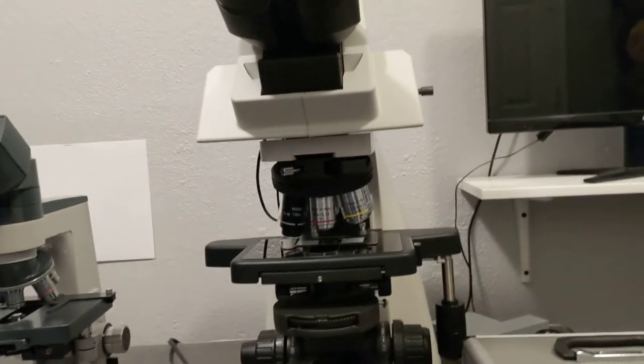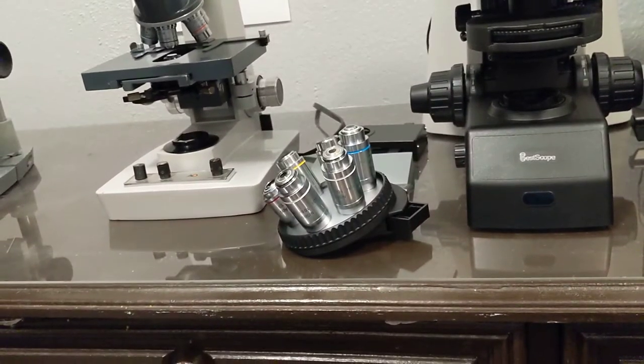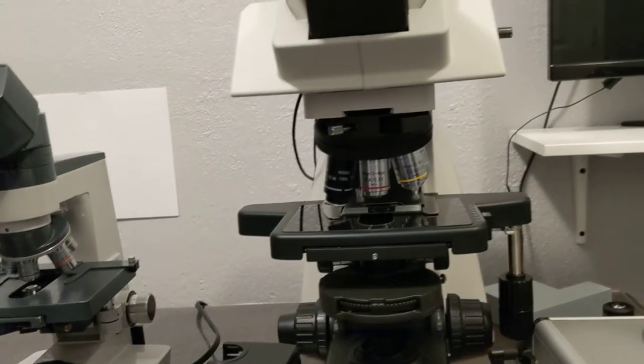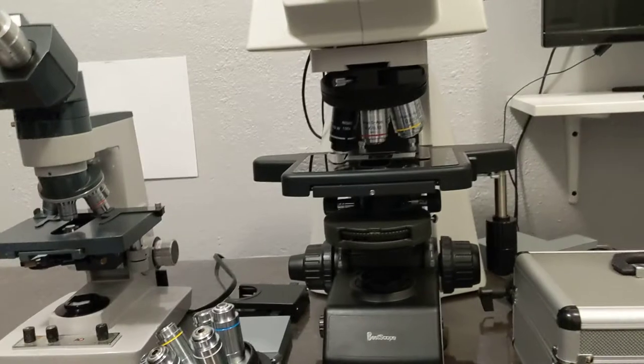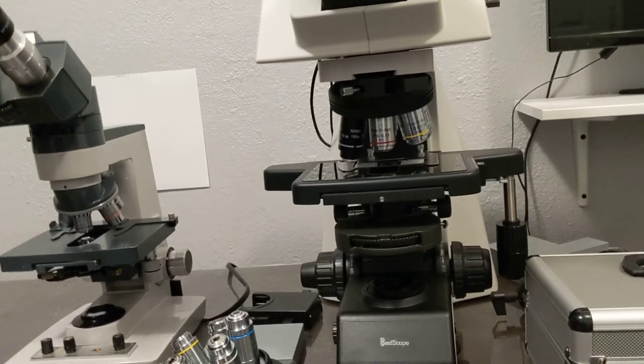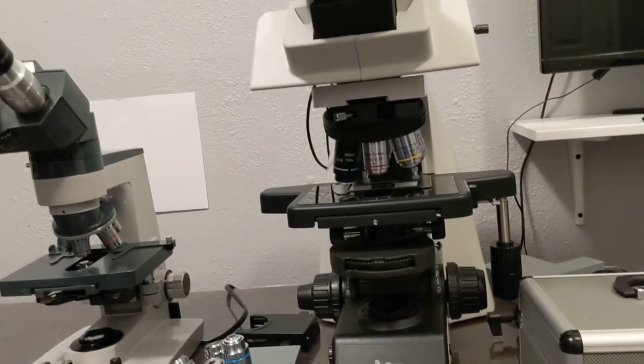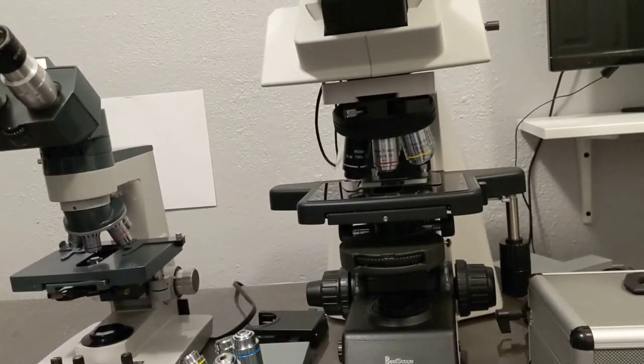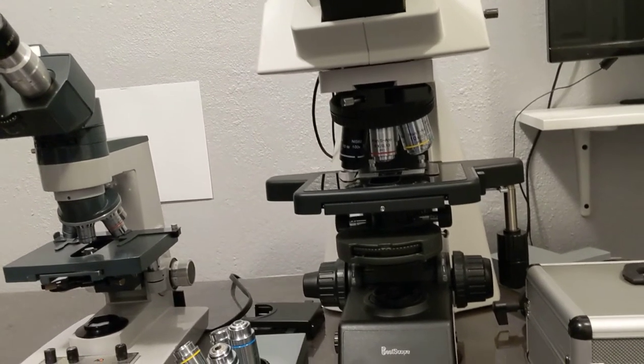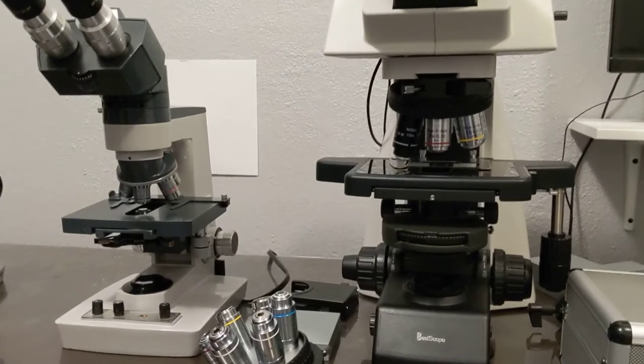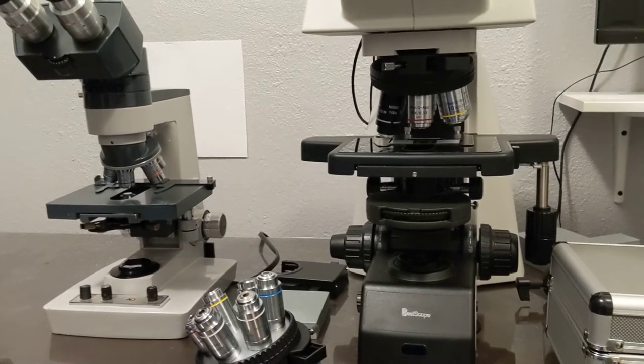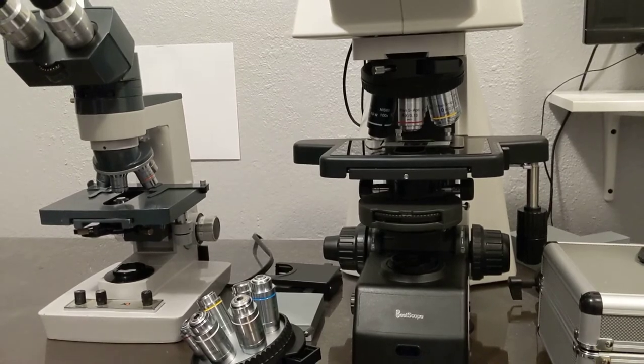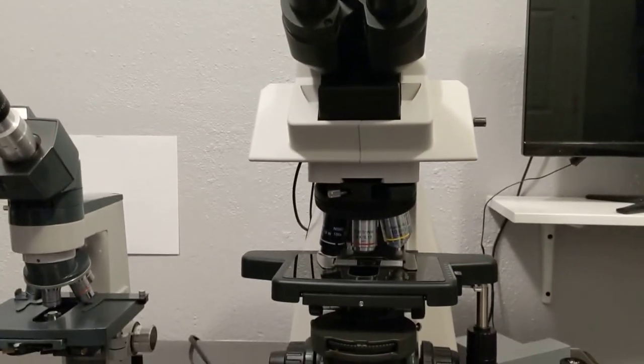When I saw that, I thought I'll buy a second nose piece. This will be my nose piece with all my bright field and DIC stuff, and then I'll have a second one with my phase contrast objectives. I have swapped them out several times, but it's just hard enough. It's a pain anyway to exchange condensers. If you're exchanging the nose piece as well, it's just enough work that most of the time I don't end up doing it. If I had to do it again, maybe I'd just buy a second microscope body.